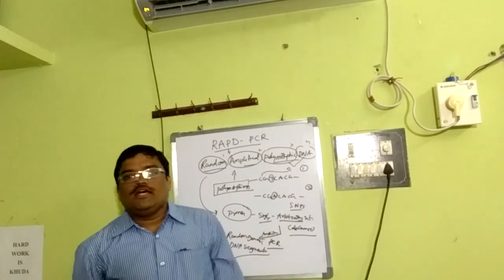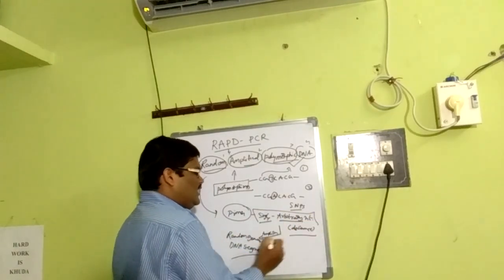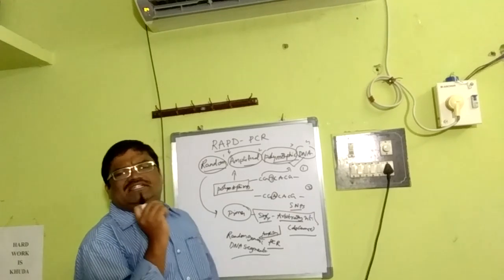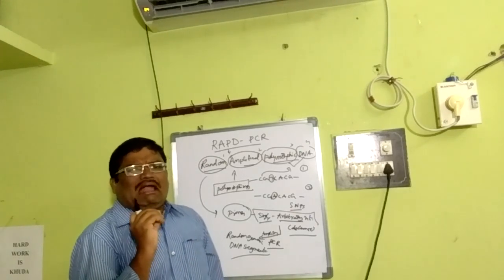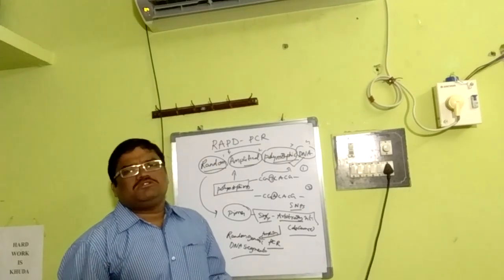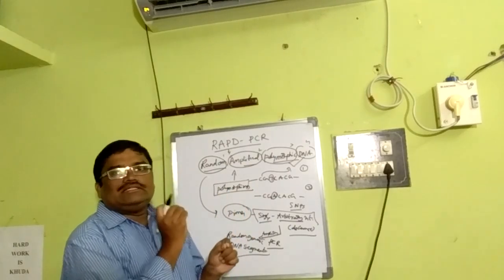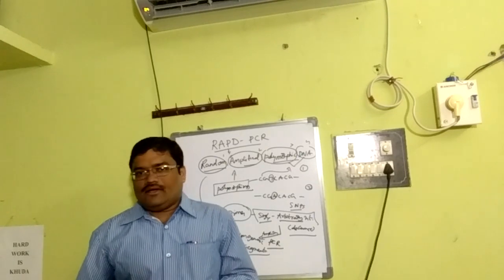That's an important point. The entire concept relies on this single arbitrary primer that, through the PCR machinery, amplifies random genomic DNA segments, which leads to RAPD markers, simply the DNA fragments. So this is how the etymology of RAPD arises.